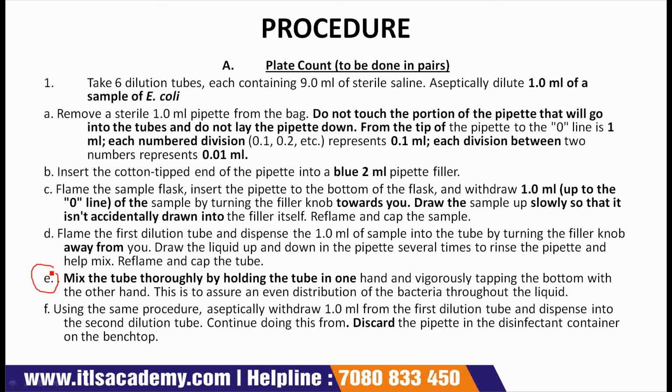Next point, mix the tube thoroughly by holding the tube in one hand and vigorously tapping the bottom with the other hand. This is to assure an even distribution of the bacteria throughout the liquid.